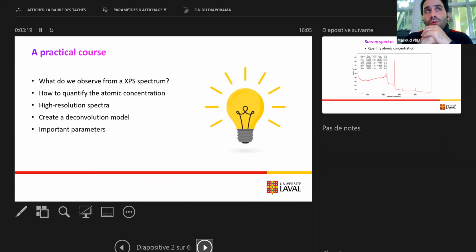I designed this course to be quite practical, so I'm not going deep into the theoretical part or the physical meaning of each parameter. Since we have 1 hour, I'm trying to be more practical, in a way that we just introduce the most important principles of CasaXPS.